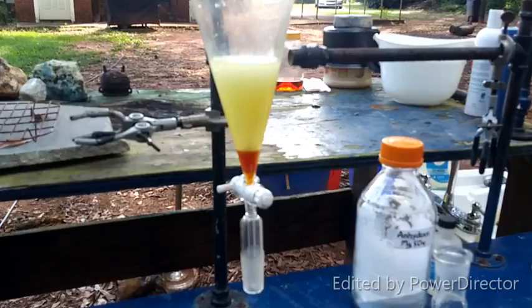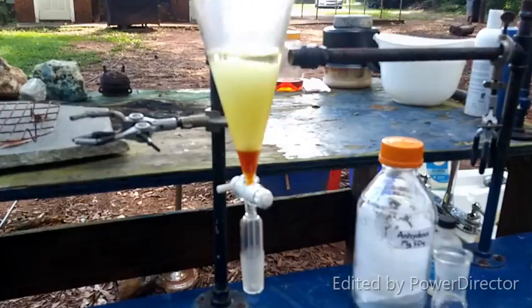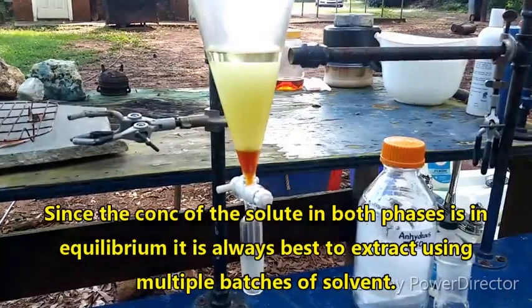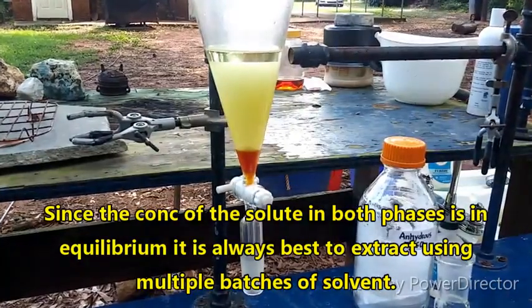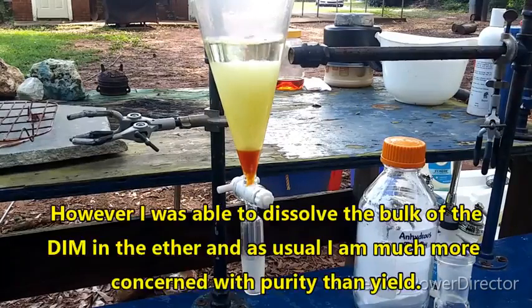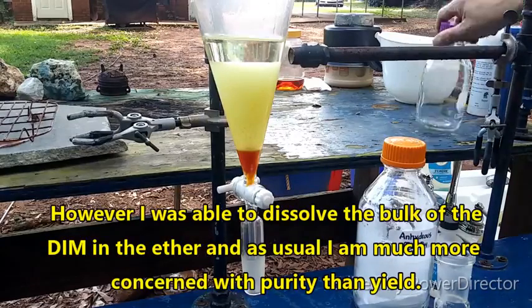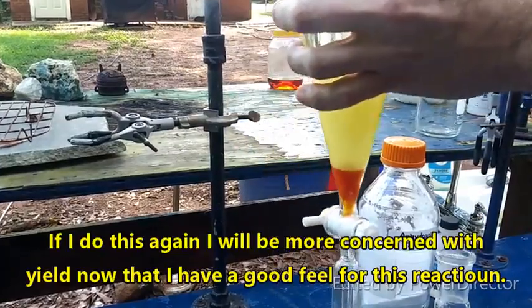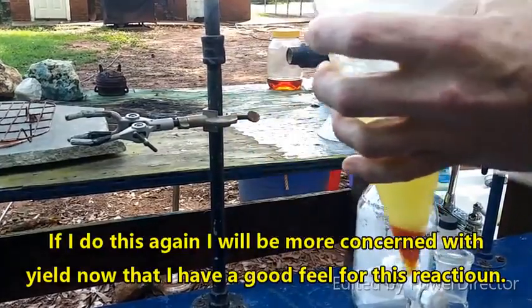And while you should always extract into multiple batches, well, we might have enough to do 2 of them. Maybe. Yeah, maybe not. Oh well. First time I've ever done this, so the yield might not be stellar. And that's okay. It's a learning experience.